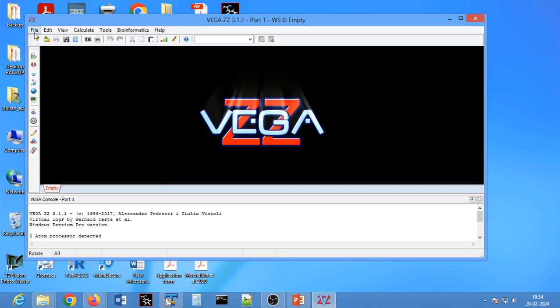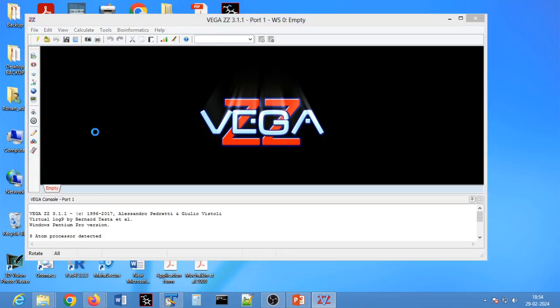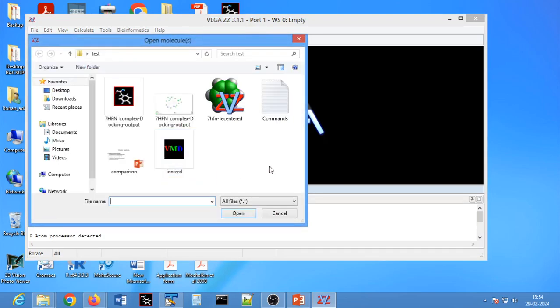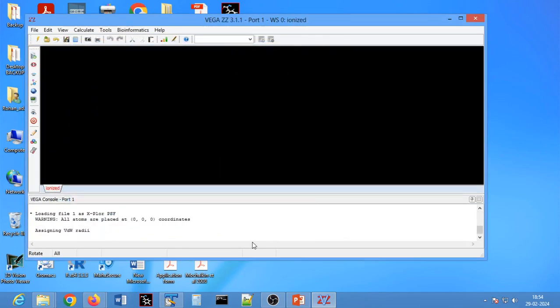And of course I will have it in the form of this ionized.psf, right? So ionized.psf is the PSF file that I would be working with, right? So it will not show over here that anything has happened, right?